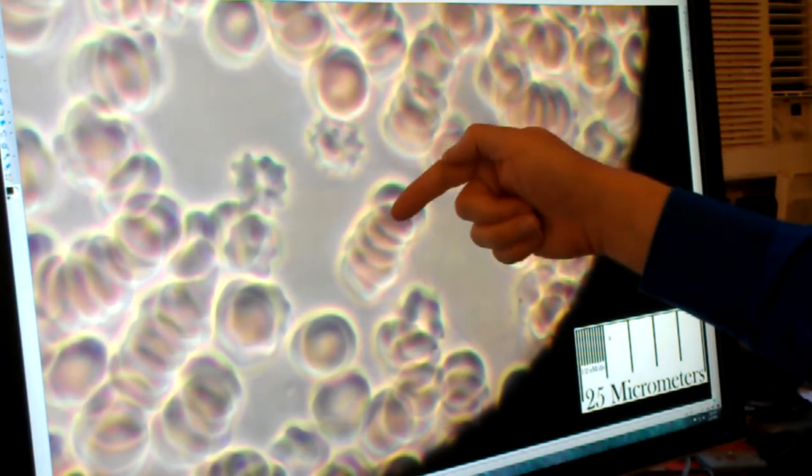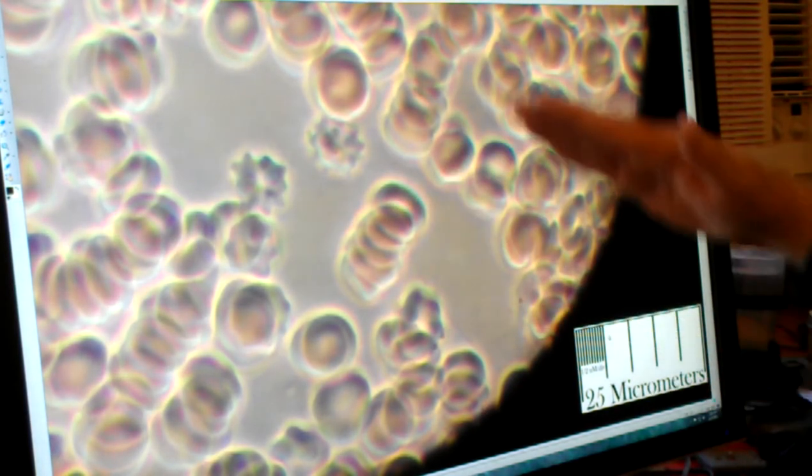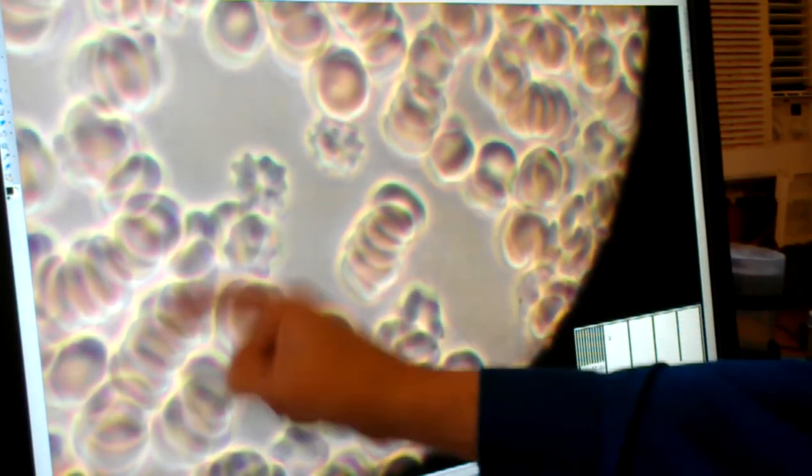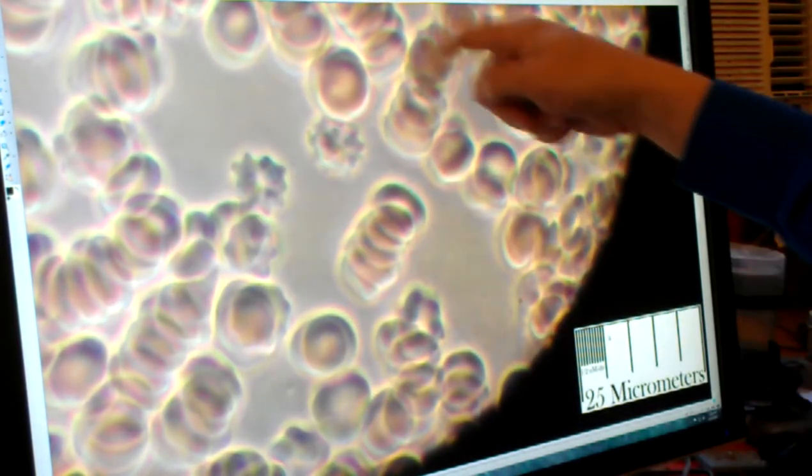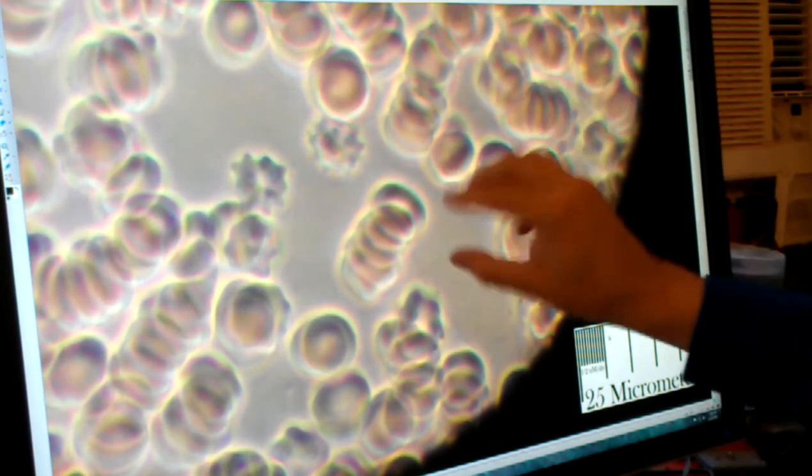So these, you can see they're stacked up like pancakes. There's a bunch of them here. This is because the blood had started to coagulate on the slide.